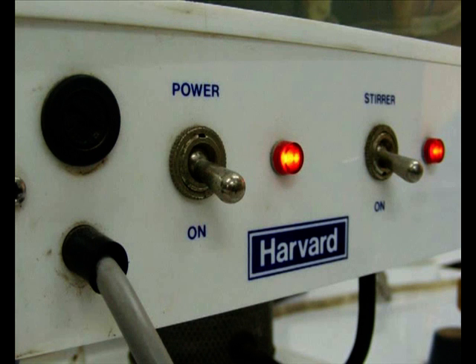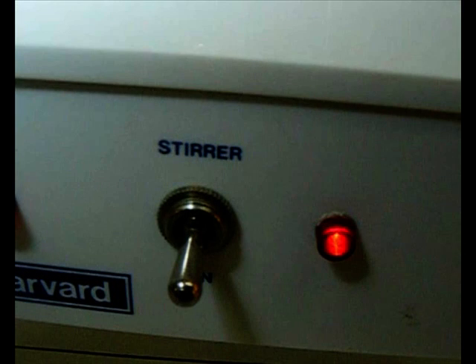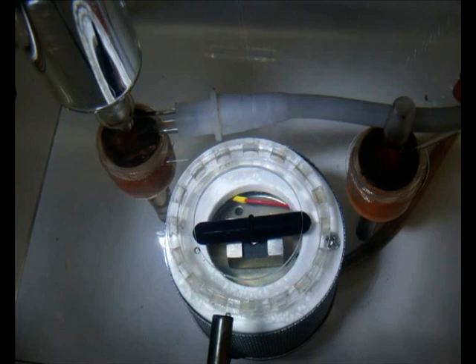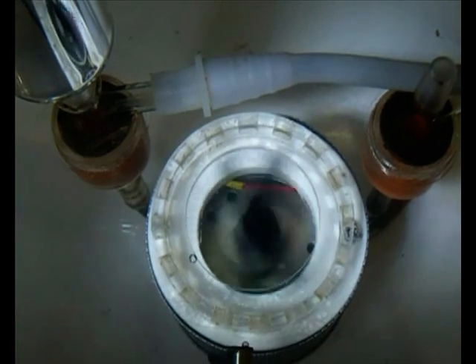The power switch turns the apparatus on. The stirrer switch turns the stirrer in the bath on. The stirrer evenly distributes the temperature in the outer bath.